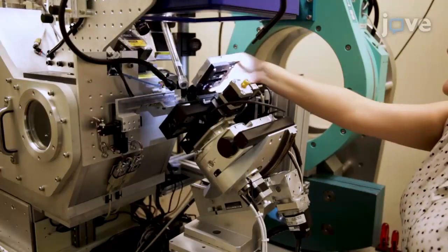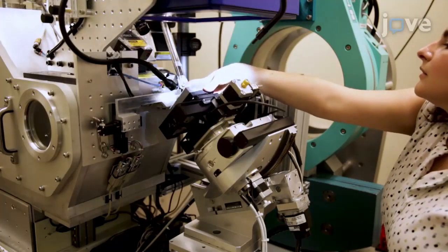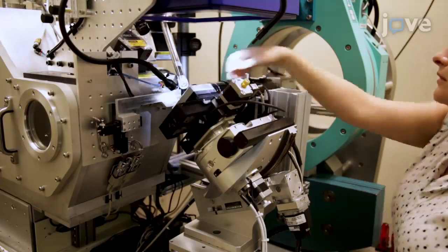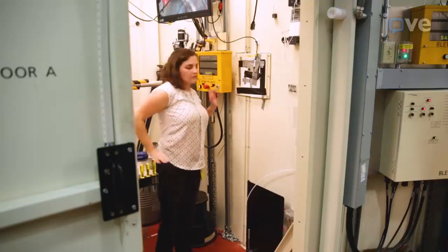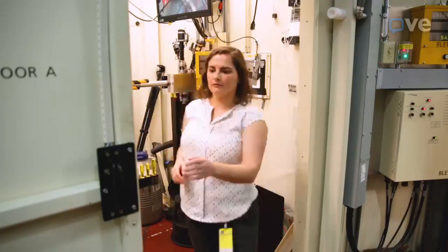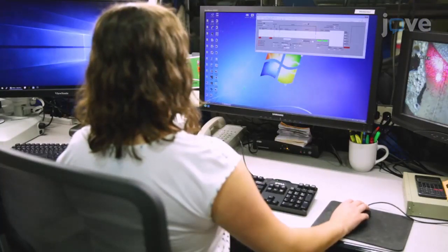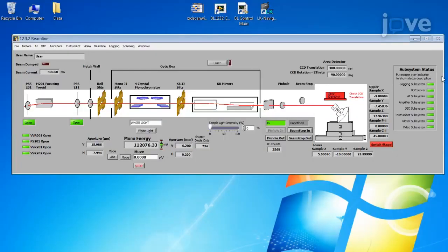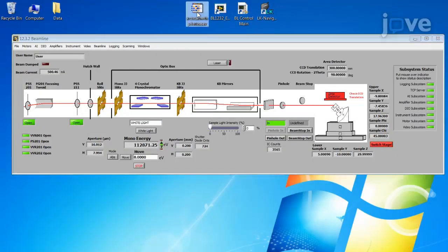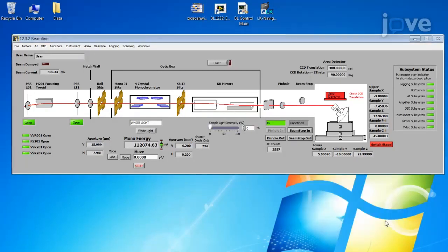Place the top half of the base on the stage in the experimental hutch and close the hutch. Open the beamline control software and initialize the program. Initialize the translation stage and slit controls. Once the beamline control program has been completely turned on, open the X-ray diffraction scan software.